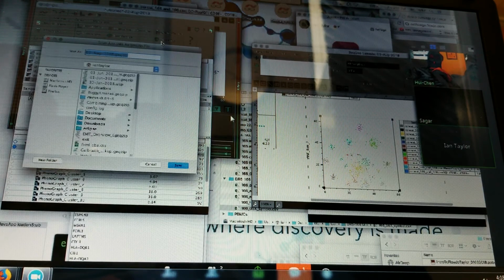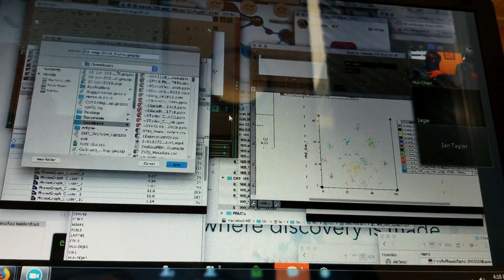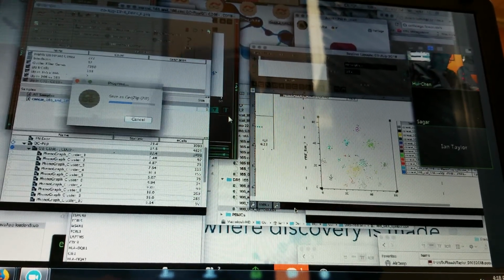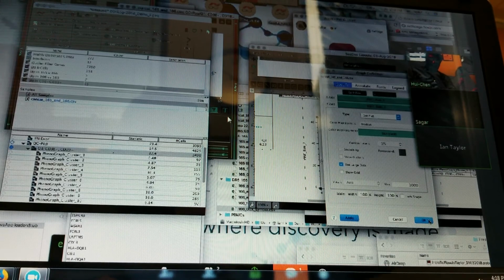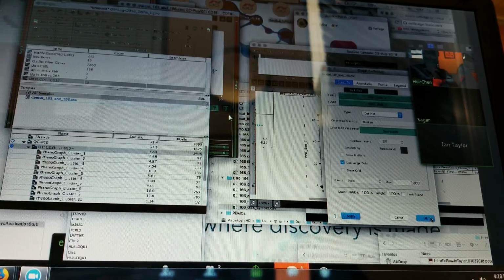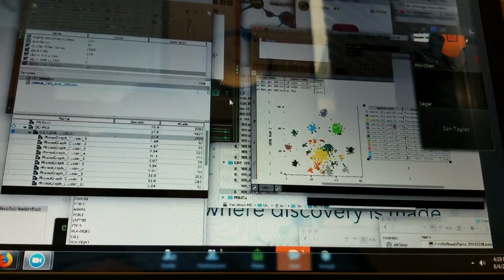I might just save this analysis because I'm kind of interested in it at this point. Can you save this, and if you send it to us, is there a way just to... I see it over here. Every cluster is color coded. I can't quite see it in detail because the resolution is not so good. But is there a way now to save each cluster? I guess it would be in a cell window or gene window. I'm not sure which window it would go into. How can you save each of those clusters so we can look at each one?